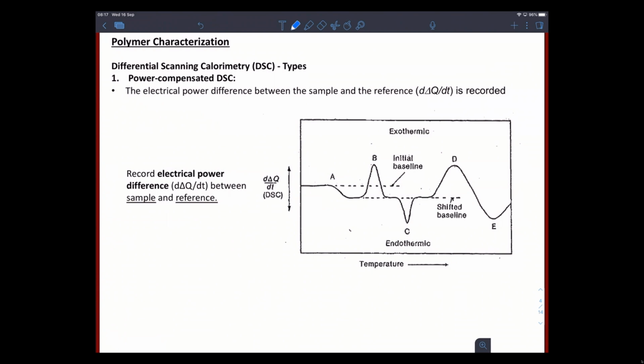It's fairly straightforward, and this is fairly consistent for any DSC measurement that you're making. So even if you change to a heat flux, this thermogram should look very similar. Moving to different instruments is not really a matter of just finding the best measurement. It's more about finding the optimum instrument to measure your particular parameters. Some operate much better at higher temperatures, some at lower. So when you're trying to find an instrument, that's what you're trying to fit to.